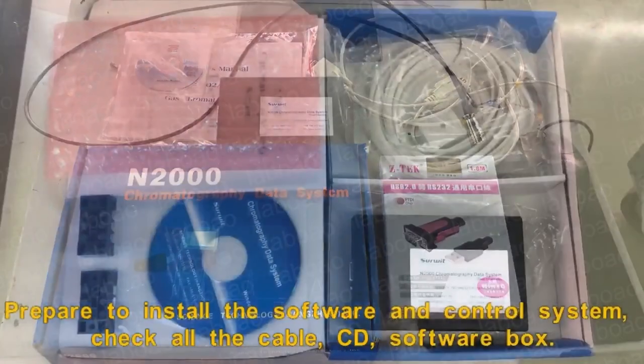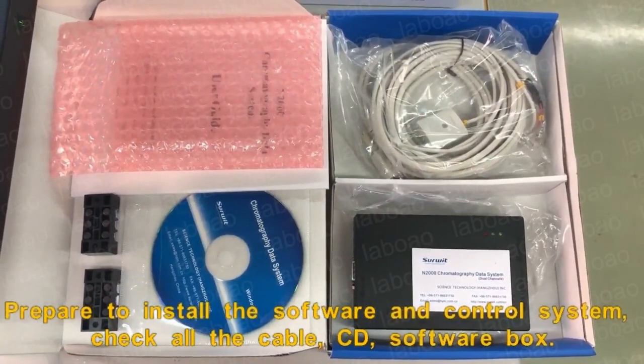Prepare to install the software and control system. Check all the cables, CD, and software box.